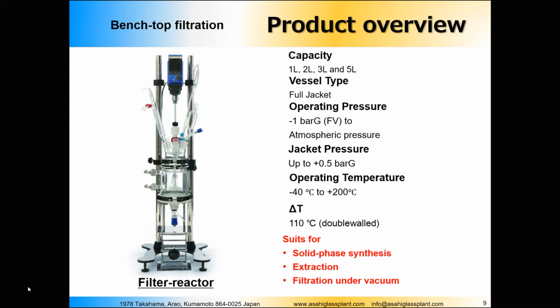For the glass manufactured by Asahi, you can have a delta T of 110 degrees, which is really great.